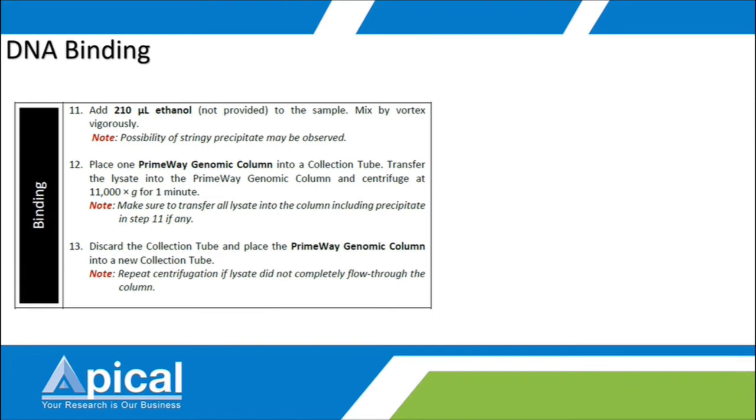Okay, so after the lysis of the cell, it will continue to the DNA binding to the silica membrane in the spin column. In most of the commercial kits, you will find that most of them are using ethanol. As mentioned in the previous slide, if you still remember, I believe all of you may still remember. You are all very concentrated.